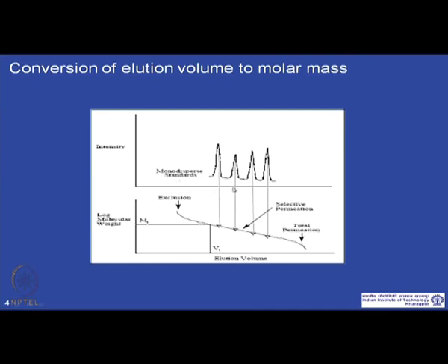So, from this calibration curve we can easily convert this elution volume to log molecular weight data. This is the way calibration is done for a GPC.